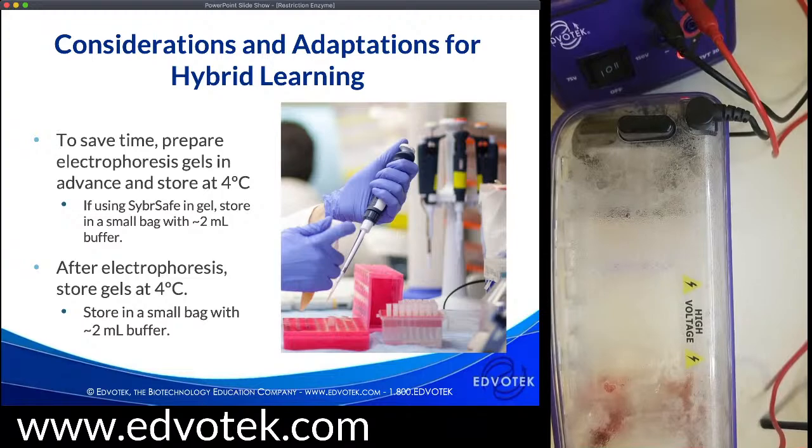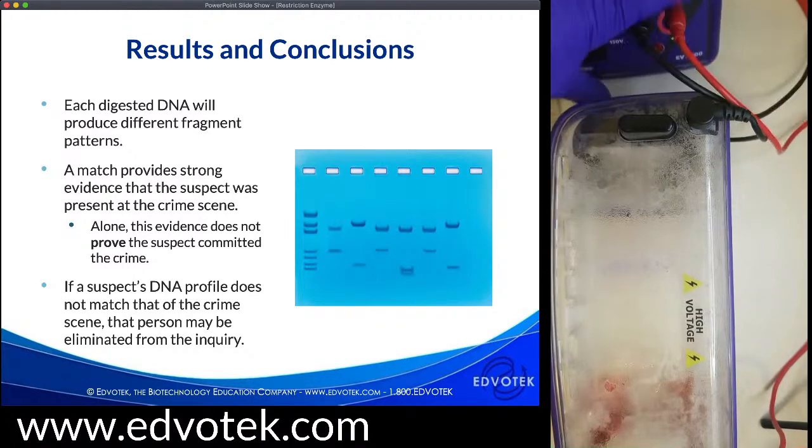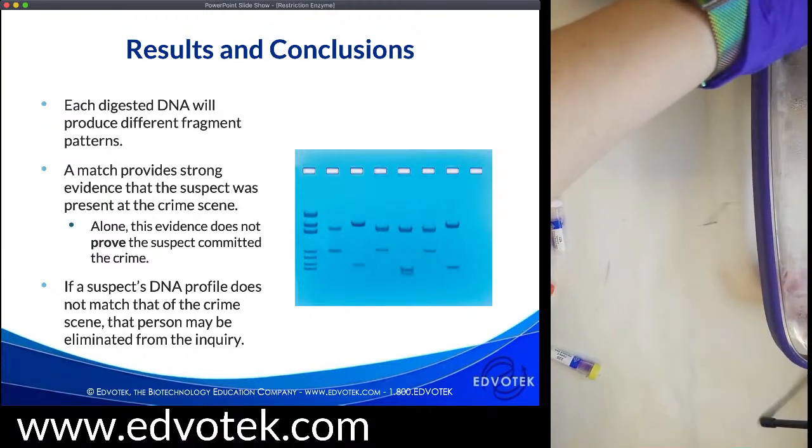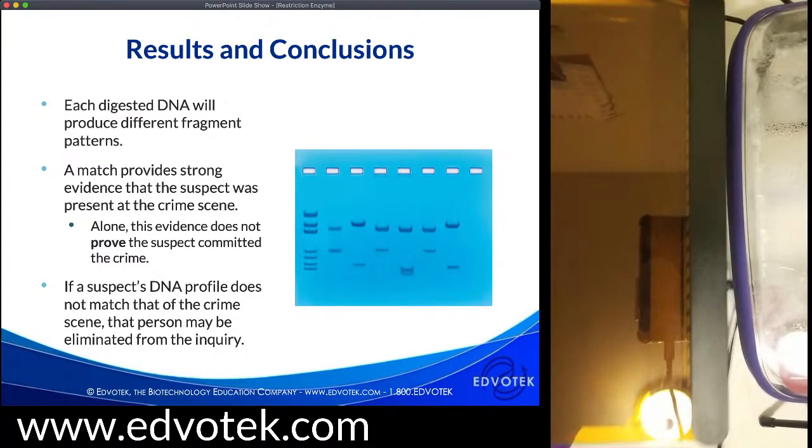After electrophoresis, you can store those gels for visualization even a week later — store in a small Ziploc bag with a little bit less buffer so you don't want your bands to diffuse and the dye to fade. Now we're going to take a look at our gels. I have the results stained with the blue light. Let me turn off this gel box, move it out of the way, and turn off my extra light to give us a little bit more with our True Blue 2. Let me start with the CyberSafe-stained gel so I can get the chamber out of the way.